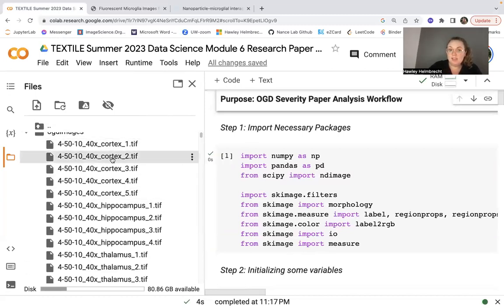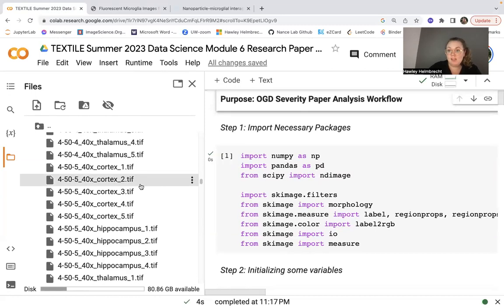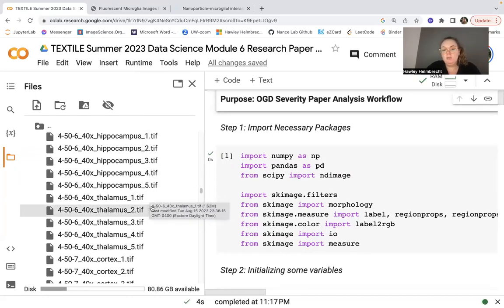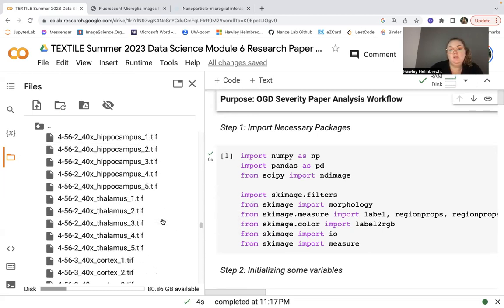So what are we looking at over here? We're looking at a large set of TIFF files. Our confocal saves the images in an ND2 file, which is a Nikon dimensionality format. That includes all of the image information, not compressed, as well as a lot of information about our confocal. I do actually work in ND2 now in my modern workflow, but I used to convert to TIFF first because I found that was easier to deal with back then. TIFF is a non-compressed version of the images that still includes all the metadata, but does not include all of the necessary Nikon metadata in order to work on this exactly how we used to on the confocal.